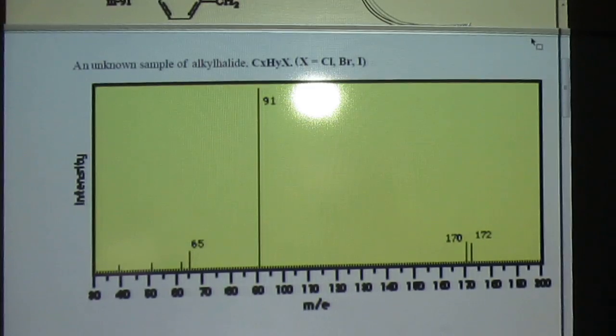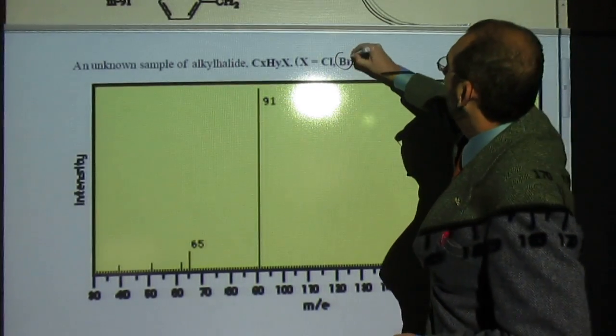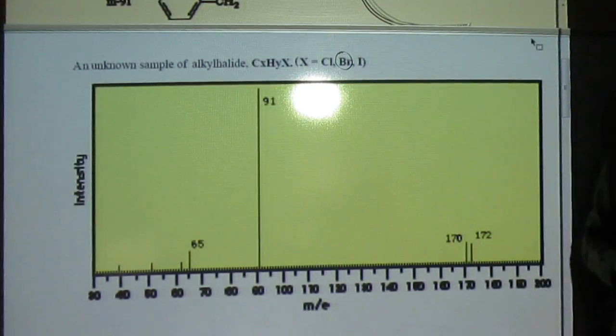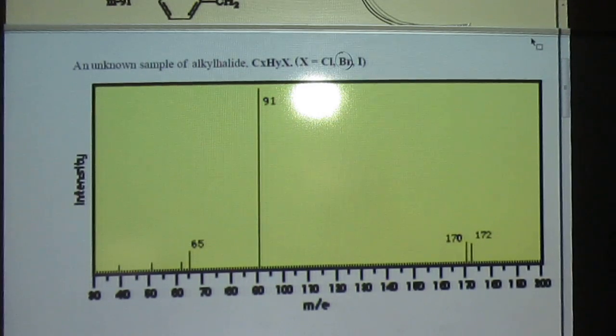Bromine. Bromine. Very good, guys. Bromine. And why do we see the two parent peaks with the bromine?